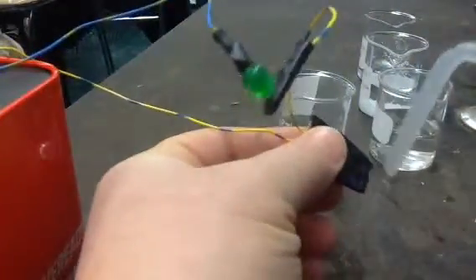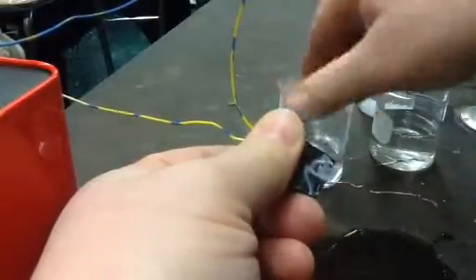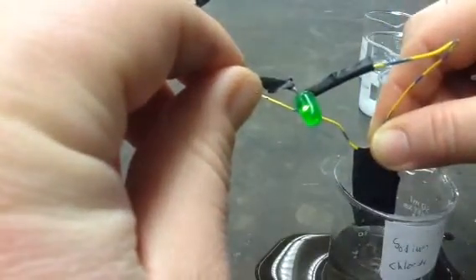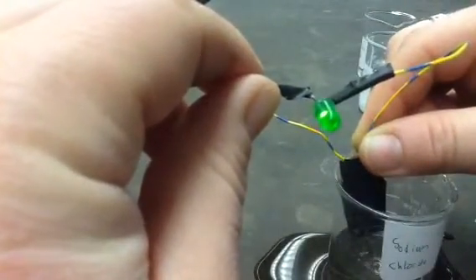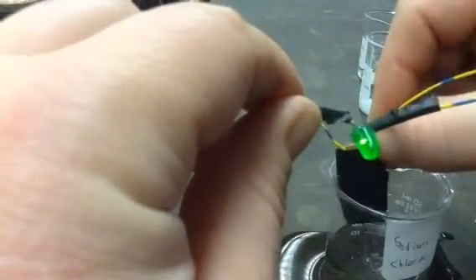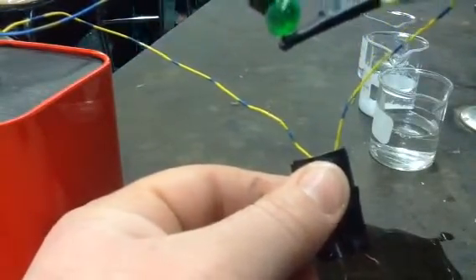Let's rinse the ends of the probes again, and I'm just going to make a mess here. There. Okay, and we have sodium chloride here. Okay, and there is our light not lit, and into the sodium chloride, we've got pretty clear conduction. That puppy lights up nicely. I realize that the video is frozen, but it definitely lights in the sodium chloride. Okay, so far we've got two that are conductive, one that is not.